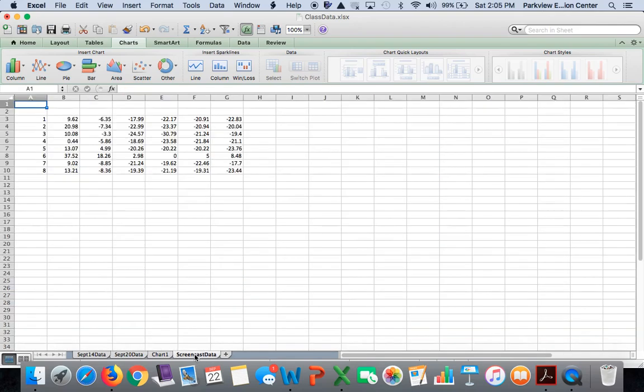The data, so when you put our data in, you just type it into Excel, this is what it's going to look like. So I thought I'd start as you're going to start right from scratch. So where do I want to start? Let's put the word trials right there. So that column heading is going to be trials. And I just typed it in and hit enter.